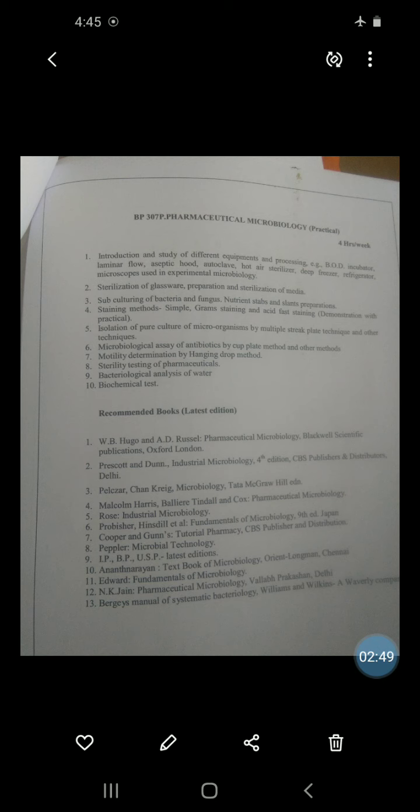The objective of this experiment is to study the motility of live bacteria for studying the properties of active locomotion. Flagella is the locomotory organ. It means the flagella is responsible for locomotion, that is, flagella is responsible for motility.